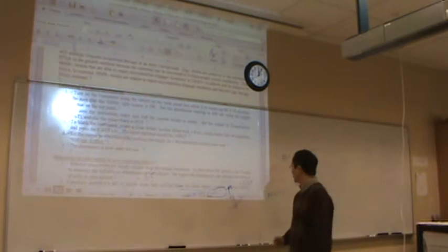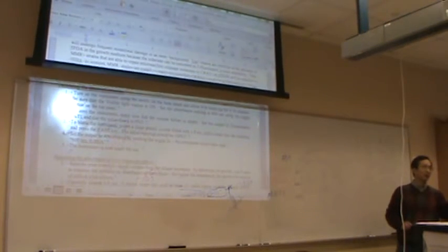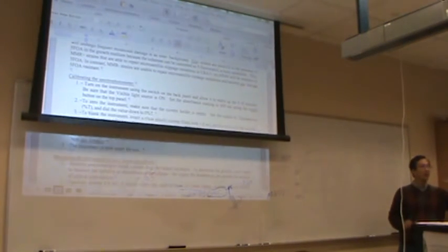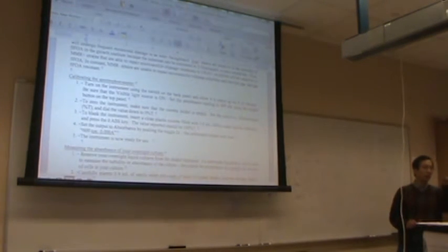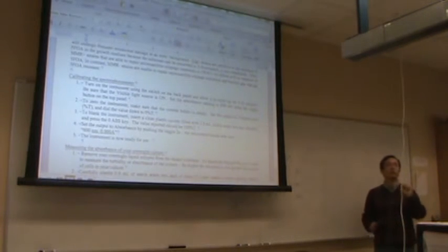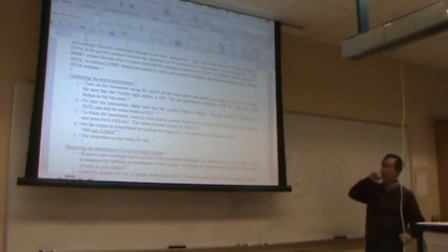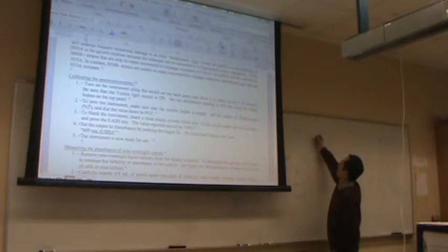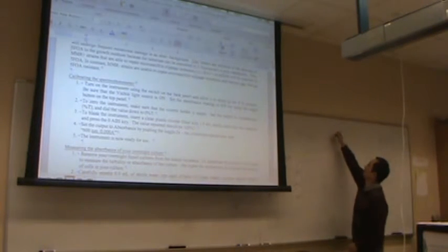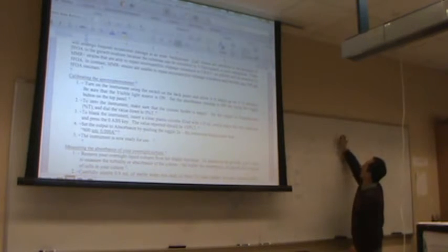What does optical density mean? We did this before. We also measured the optical density for nucleic acid. After we purify the plasmid, we use a NanoDrop to measure the optical density at a wavelength of 260 nanometers. And for cell number, we often use OD 600 nanometers. If we put this in a cuvette, the light will pass through.